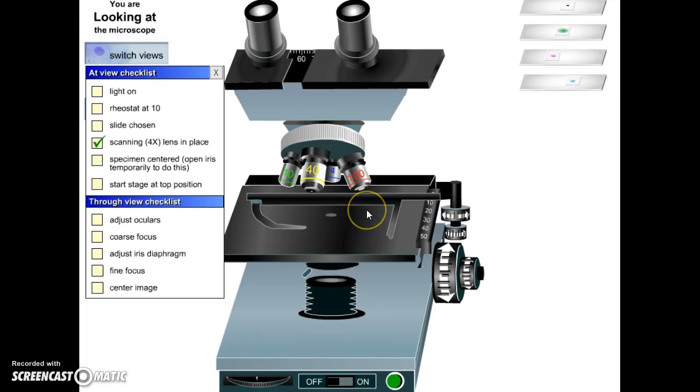After you unplug your microscope, then you must clean each individual lens with a Kim wipe. You are to take a Kim wipe, cover it over one finger and gently wipe over each individual lens. This must be done very gently because we don't want to scratch the lenses. After that, you may put your microscope away and you are finished using your microscope.